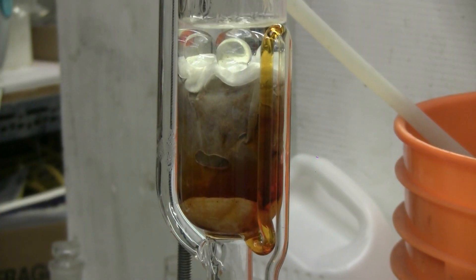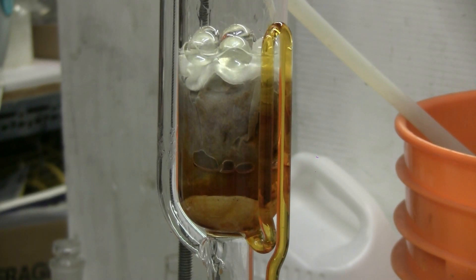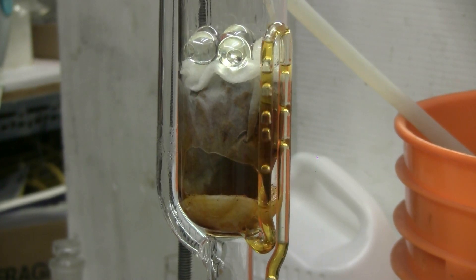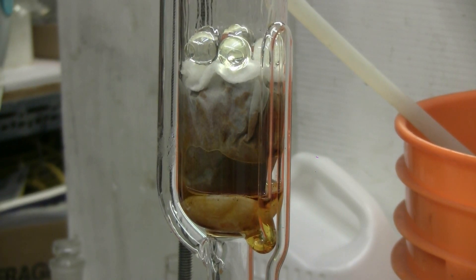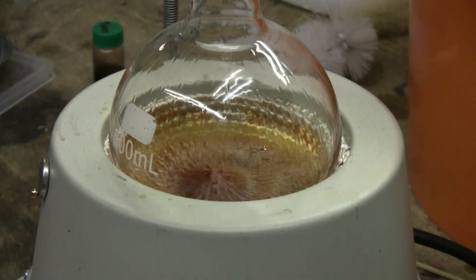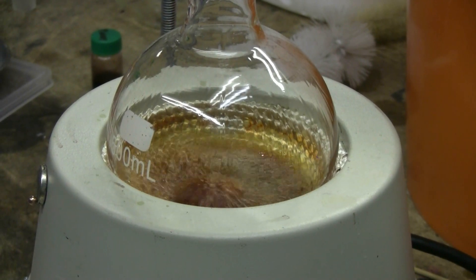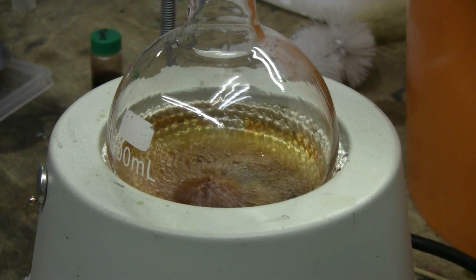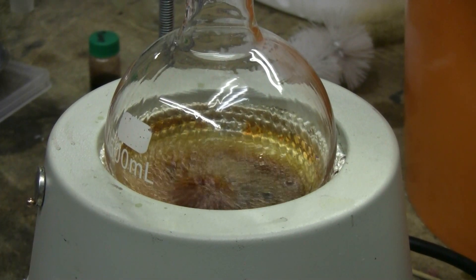This is cycle number 30 of the Soxhlet extraction of sweet paprika powder using ethanol. The sweet paprika is quite faded in the filter paper now, although it is still giving an orange-yellow extract that's much fainter than cycle number one. If we look down in the boiling flask, our collected extract is a nice deep orange-brown color, so I'm definitely getting something here. I'll probably let this go five to ten more cycles and then stop for time reasons.